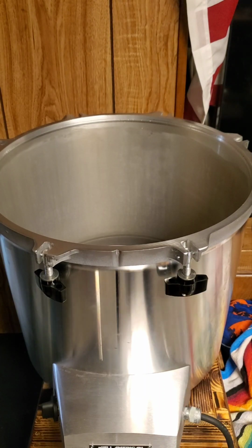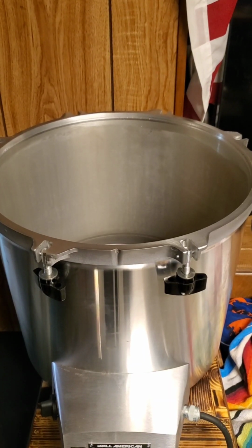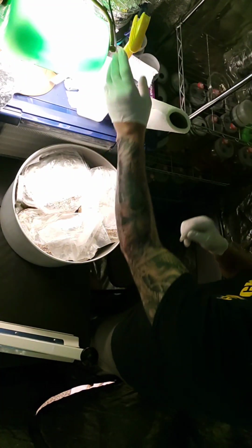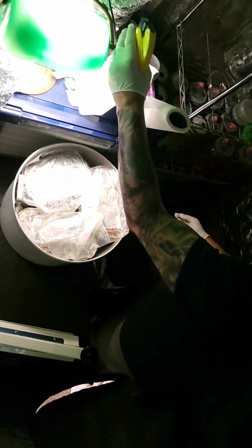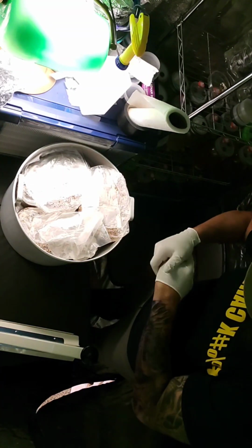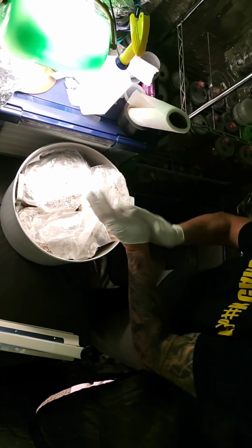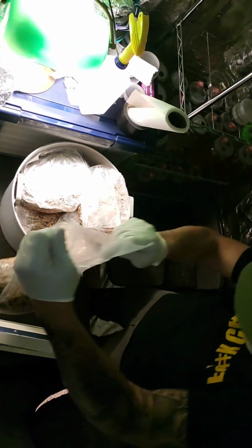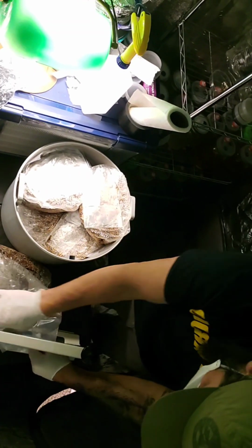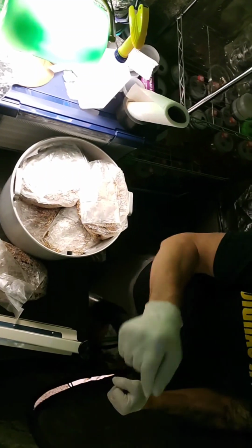Now we're going to put some gloves on and seal those up. All right, we're back in the lab. Usually it's a much quicker process. I'm usually just in, not really worrying about the camera, but with the mask on, sanitized, ready to go. I'm gonna go ahead and mop these out, get them sealed. Gotta make sure it's plugged in first.